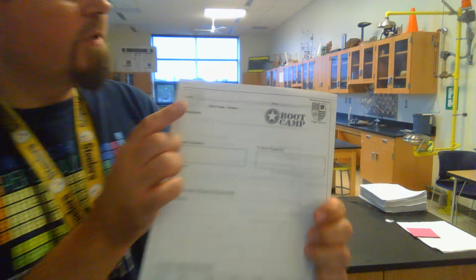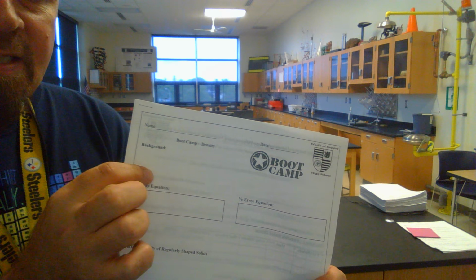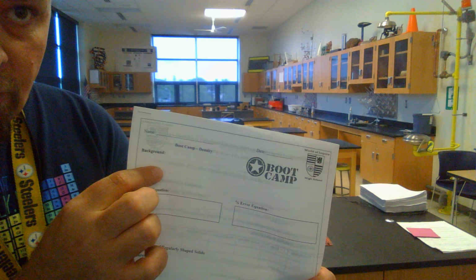Pre-lab for the density lab, first lab, unit one. Here we go. Check out how to do the lab. So, first off, background. You got to fill this in. So, definition of density, something about it being an intrinsic value. What does that mean to you in your own words?